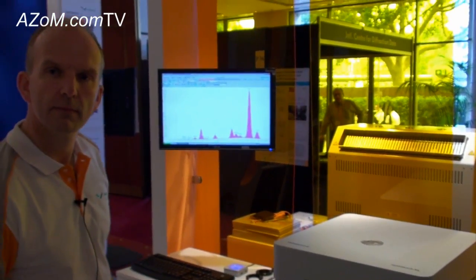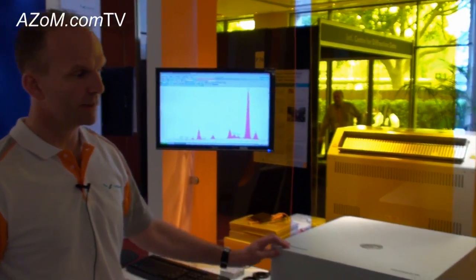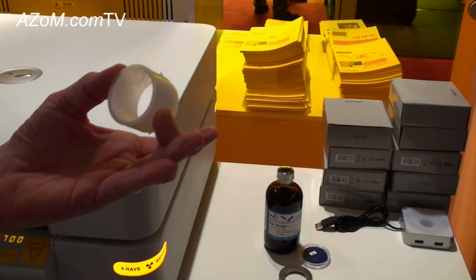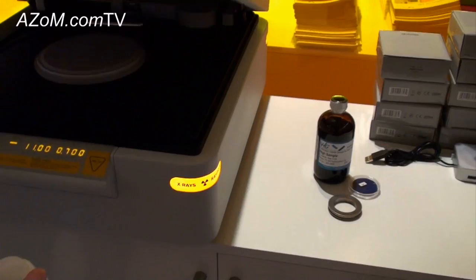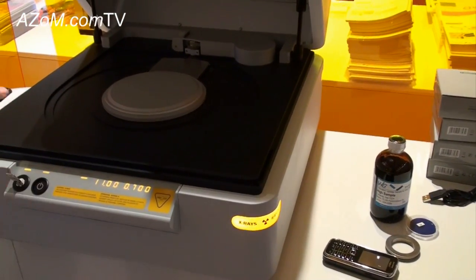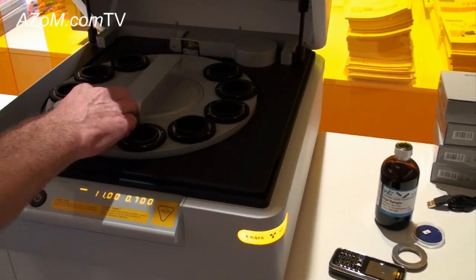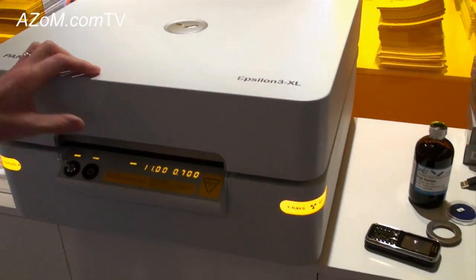You can obviously do liquid samples and loose powder samples — that's quite correct, yes. Here we have a cup which we would use for analyzing liquid samples. This would just fit into the carousel like so. We place the carousel back, place the liquid cup in the sample holder, close, and then you can analyze.